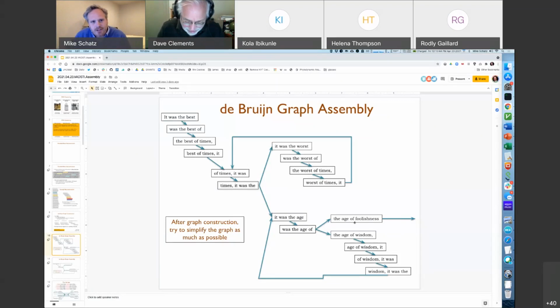So what assemblers do is they resolve it as much as they can up to those branch points. Those are the contigs that are output. Then you use other types of information like paired-end sequencing, mate-pair sequencing, or optical maps to tie those together, hopefully into complete chromosomes. But if the repeats are too long or there's still too much complexity, you won't get entire chromosomes reconstructed end to end.